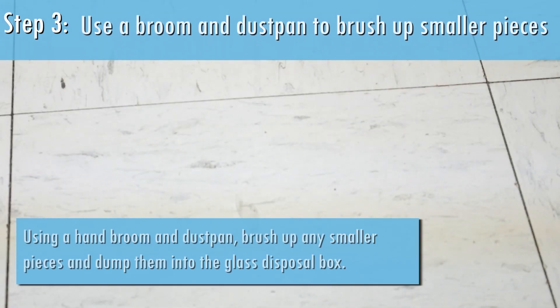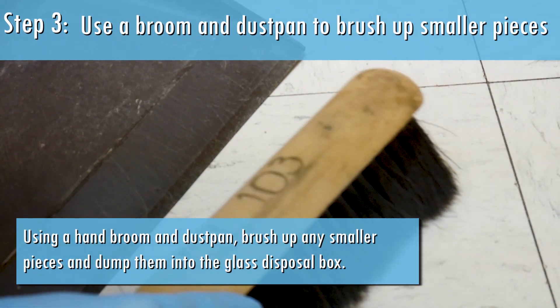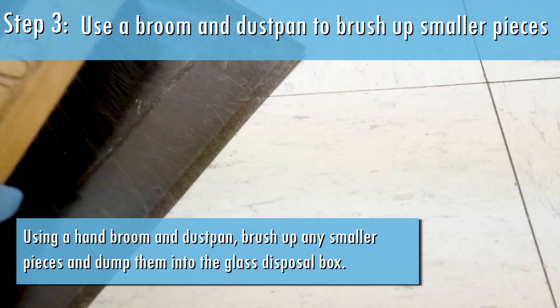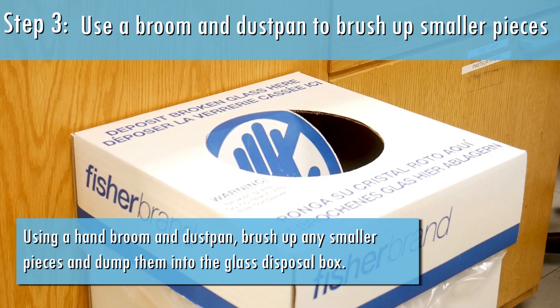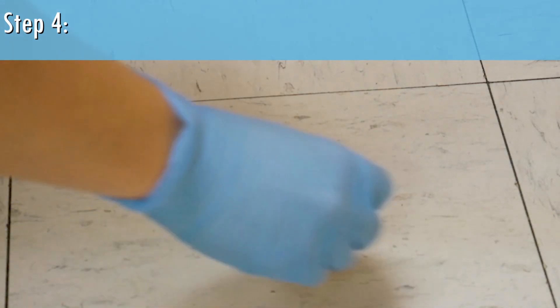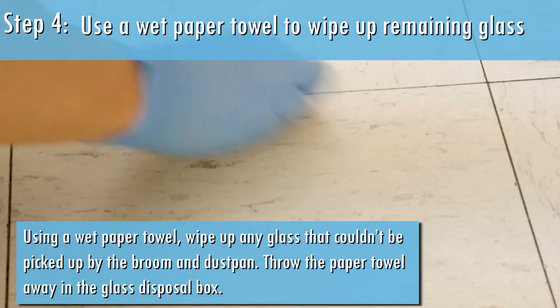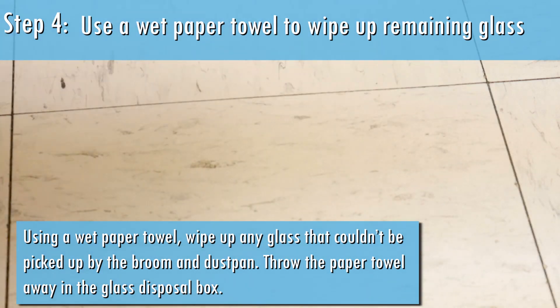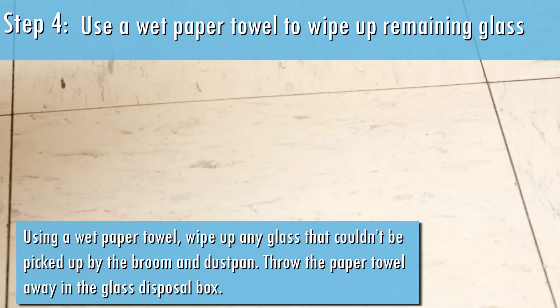Step 3: Using the hand broom and dustpan, brush up any smaller pieces and dump them into the glass disposal box. Step 4: Using a wet paper towel, wipe away any glass that couldn't be picked up by the broom and dustpan.